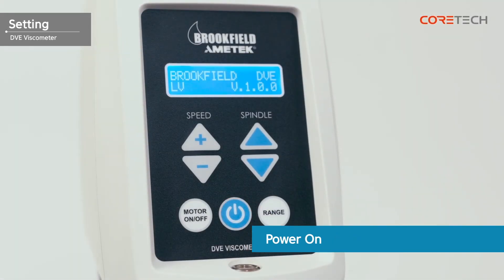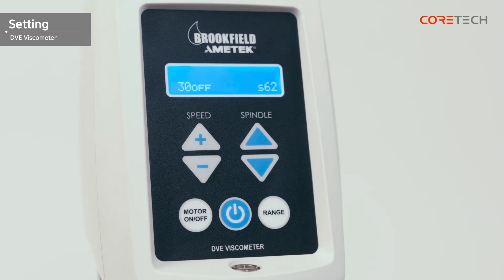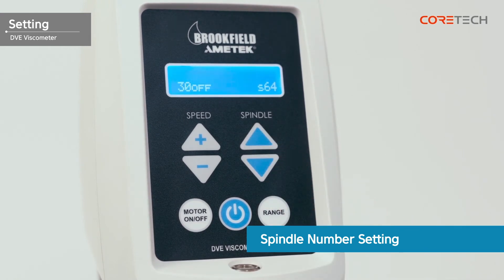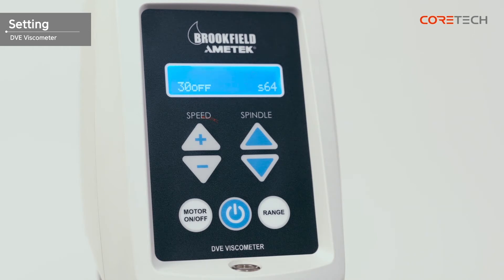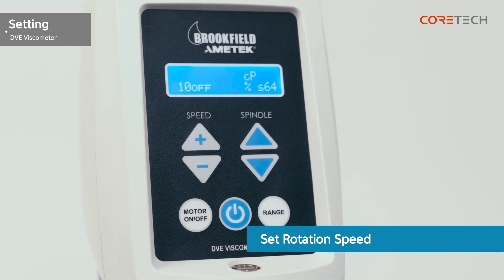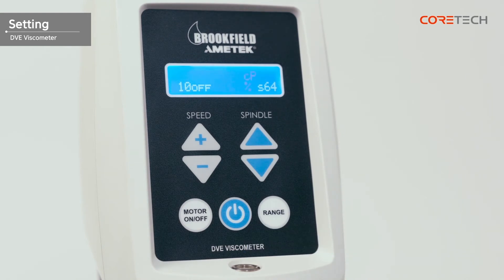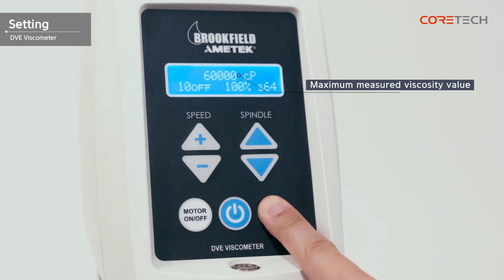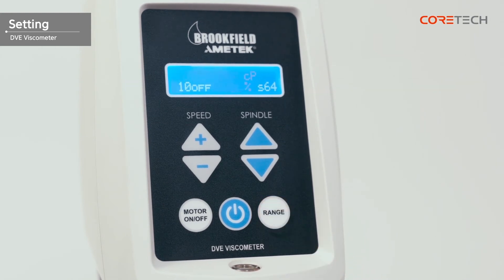Turn on the main body by pressing the power button in the center. Press the spindle button to select the spindle number. Press the speed button to set the desired rotation speed. For low viscosity samples, select a high RPM rotational speed; for high viscosity samples, select a low RPM rotational speed. Press the range button on the bottom right to see the maximum viscosity that can be measured under the current conditions. If the maximum measurable viscosity value is lower than the expected viscosity value, the RPM or spindle must be changed.